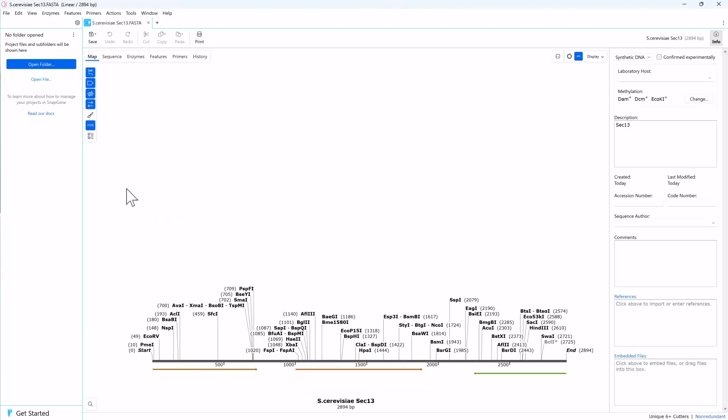SnapGene displays any predicted open reading frames as arrows in map view. Orientation is marked by color, with forward open reading frames in orange and the reverse in green.